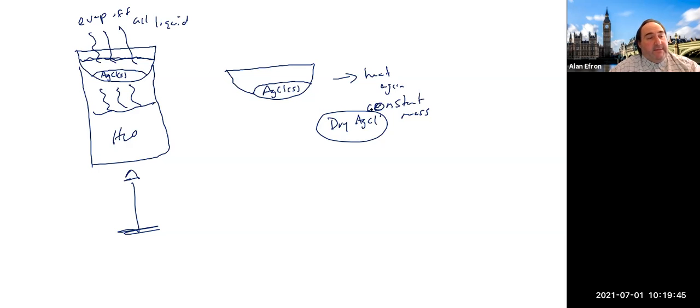We reacted the silver with nitric acid, allowing the silver to be available for the chloride that's going to be added with the hydrochloric acid. Once the silver ions and the chloride ions get near each other, based on solubility rules, they have a very good attraction to one another. They're going to come together and make a solid. We then evaporate off the liquid component that's left over, because we're really interested in just the solid that's there.